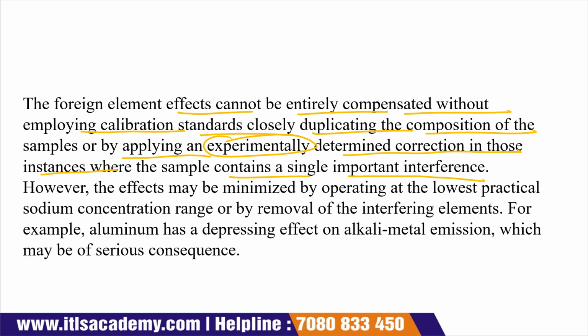However, the effect may be minimized by operating at the lowest practical sodium concentration range, or sometimes by removal of the interfering elements, like aluminum, which has a depressing effect on alkali metal emission and can also cause serious consequences. These are the interferences which affect our experiments.